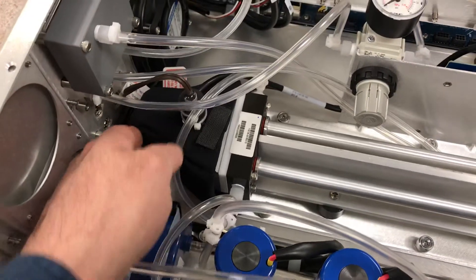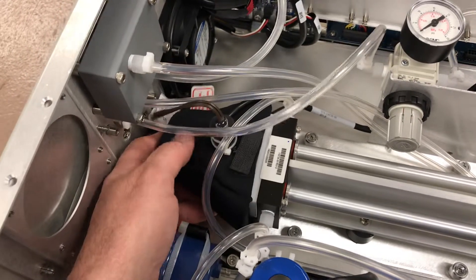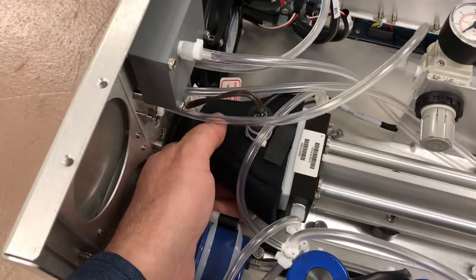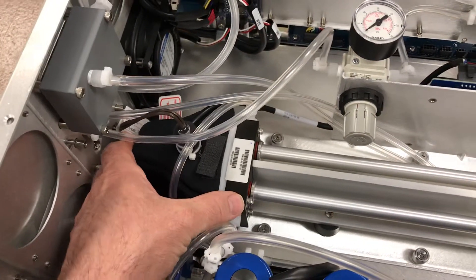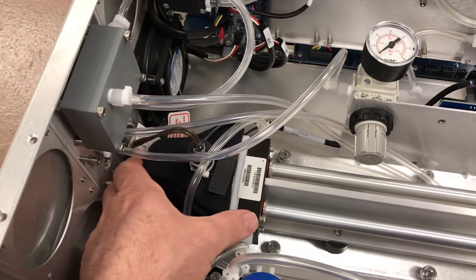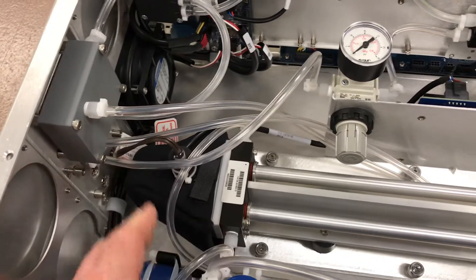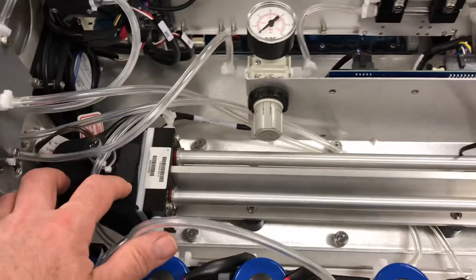They've done an improvement here — they've put a little heater cover over the back end of this instrument to protect that heated block, which is a great idea over the previous instrument. This will help maintain the heat in stations that have trouble with climate-controlled air quality stations, which often happens out in the field, helping the instrument maintain the heat on this block.